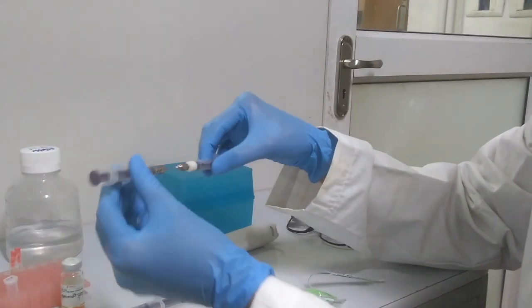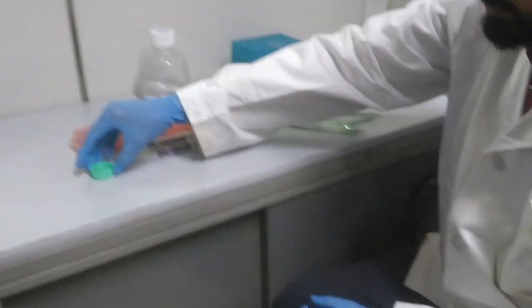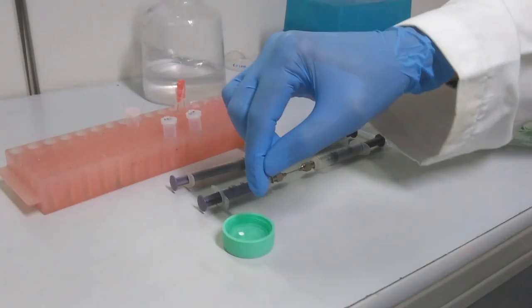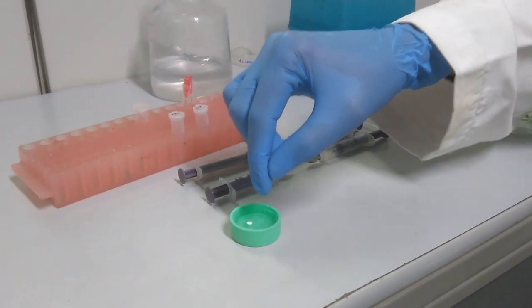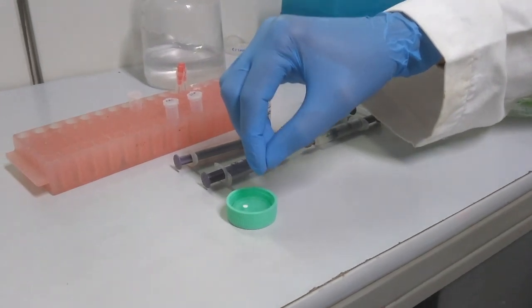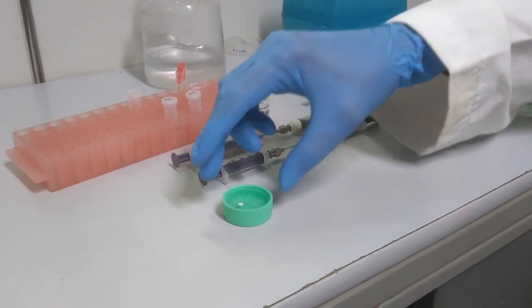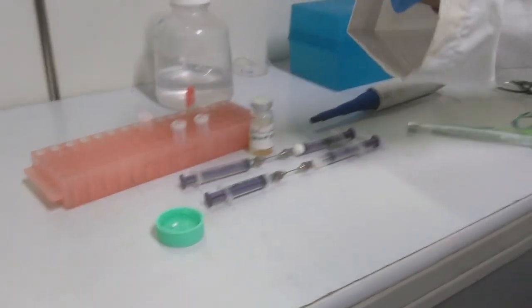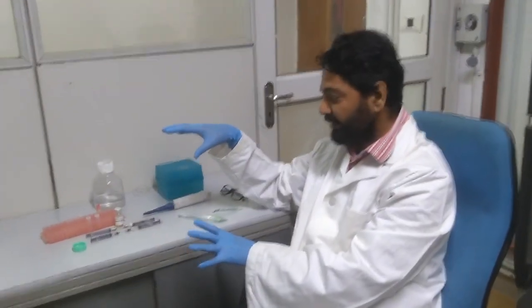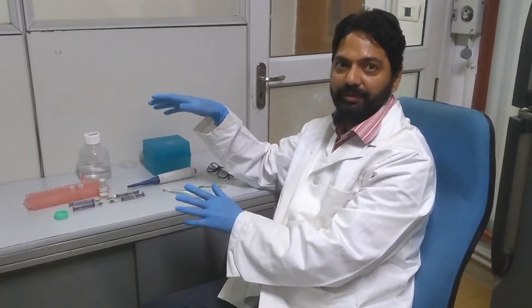So how do you check them? For checking purposes, we drop a drop of emulsion on a water surface like this. If the emulsion is not formed perfectly, this will spread out. Otherwise, it will not spread. So this is a check that your emulsion is formed correctly. Once you find that this drop is not spreading, your emulsion is actually ready for injection. So this was the process by which we prepare the emulsion for injection. This is the first step of preparing your emulsion.